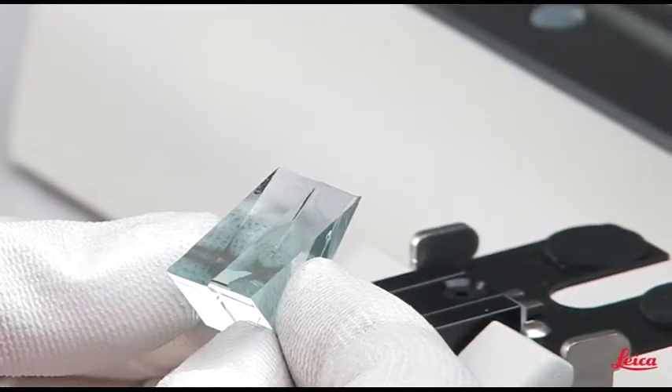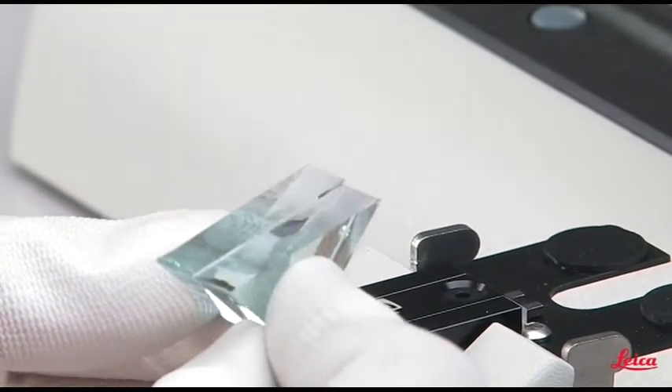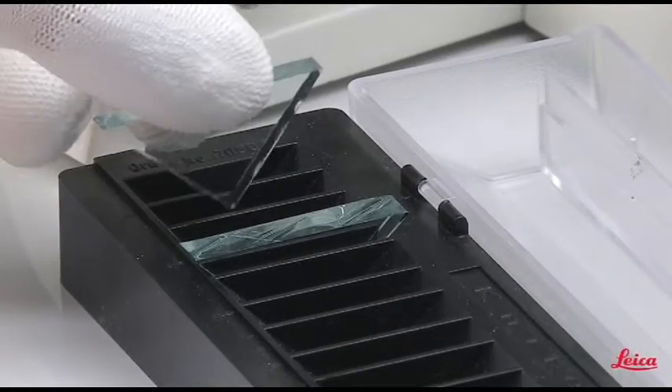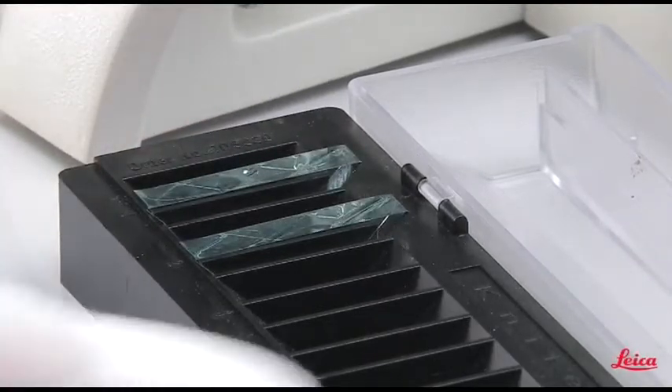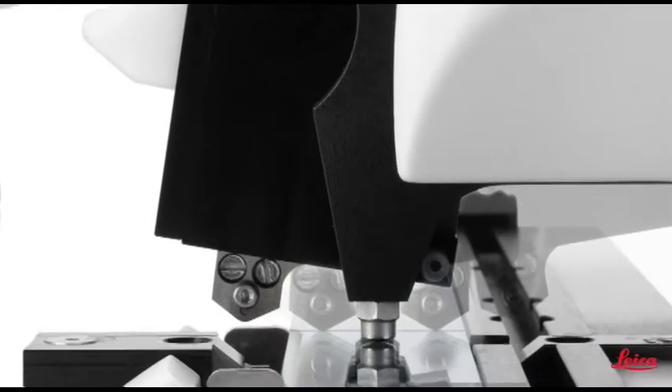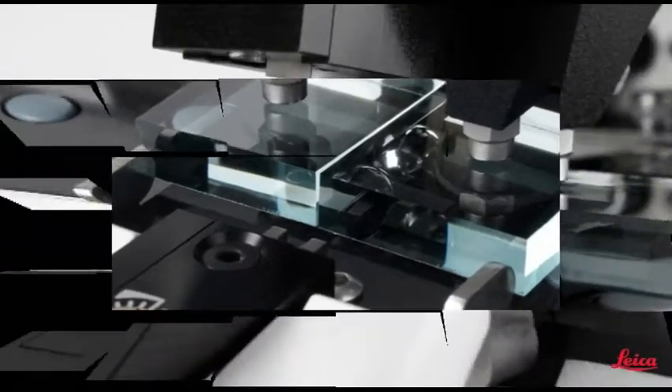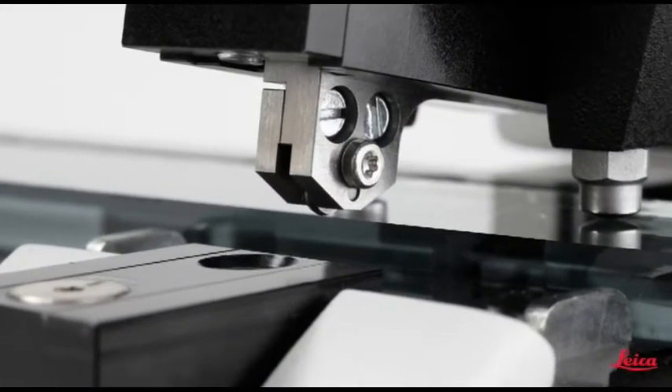All the new features of the Leica EM-KMR3 help make the production of glass knives easier and more reproducible for electron as well as light microscopy sectioning techniques. For students, routine users, through to the demands of the experienced cryo-ultramicrotomist, the new Leica EM-KMR3 is the unsurpassed instrument of choice for producing high quality glass knives.